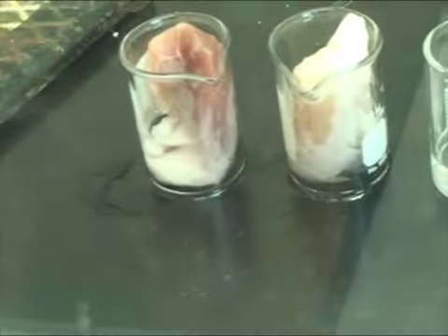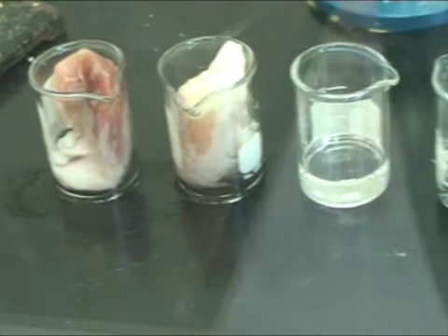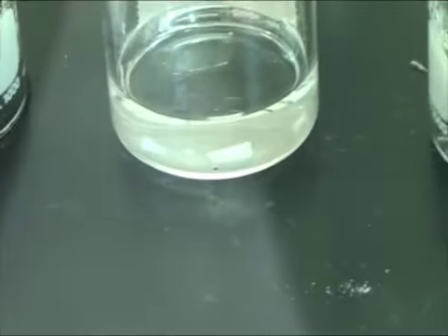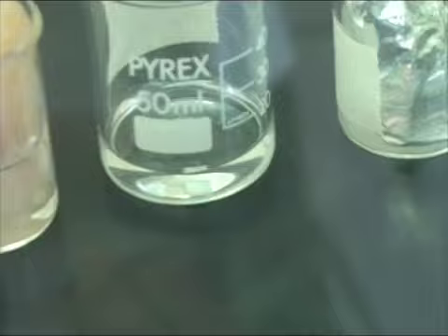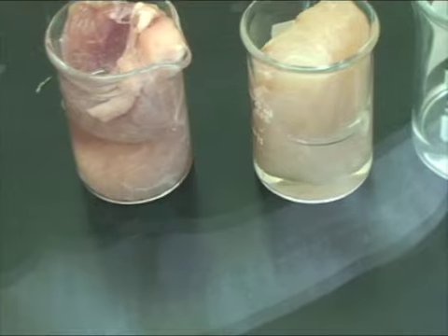After roughly 13 minutes, the fish and beef looked incredibly white. The limestone was still producing bubbles. Hopefully you can see a couple there. The acid aluminum was producing a tiny bit of bubbles still. The pork and fish on the water side, still no reaction. The CaCO3, quite a few less bubbles than on the acid side, however there were still some. And the aluminum on the water side had no change whatsoever.